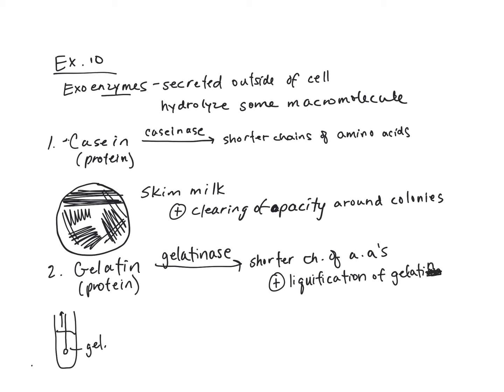All right, so one caveat. For a positive result, it's usually just a little bit runny up at the top here. Usually the whole tube doesn't liquefy. We just don't get that much growth from our organisms that are positive. But there's one caveat here in reading the results. Gelatin, when the temperature is less than 25 degrees Celsius, is going to be solid.